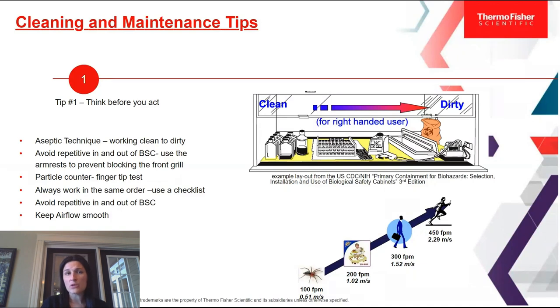We also recommend that you use armrests to prevent blocking the front grill. The inflow velocity rate per NSF guidelines is 105 feet per minute, and if your arms are blocking the front of the grill, your BSC has to compensate for that additional resistance. We recommend using the armrest so your hands are hovering above the front grill and not blocking that area.